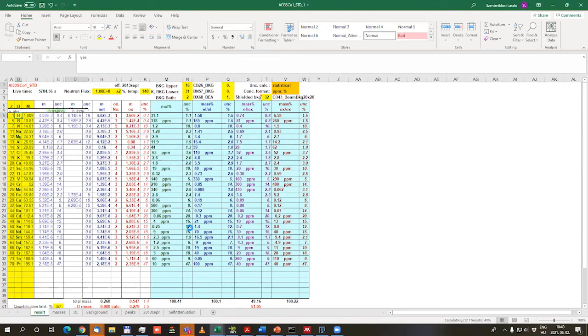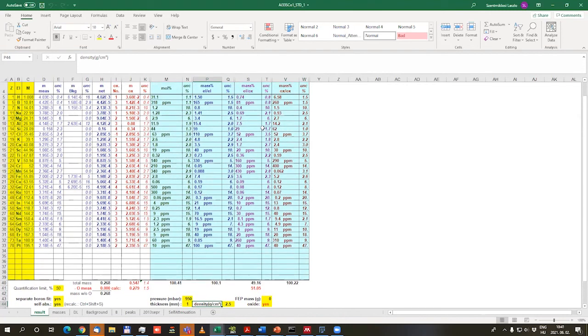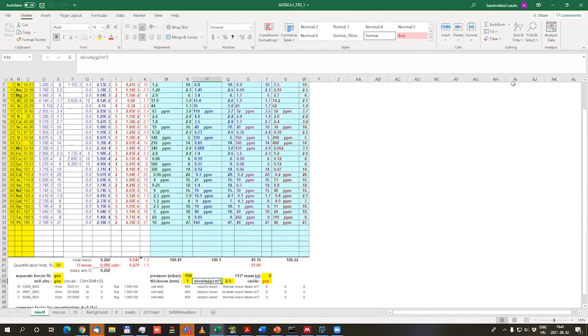Usually the main components are just marginally adjusted if they have both high energy and low energy lines. So this self-absorption correction affects elements like boron or rare earth elements, which are predominantly analyzed by their low energy lines, and they do not have any high energy analytical line. Okay, so that was all about concentrations, and now this correction is over.